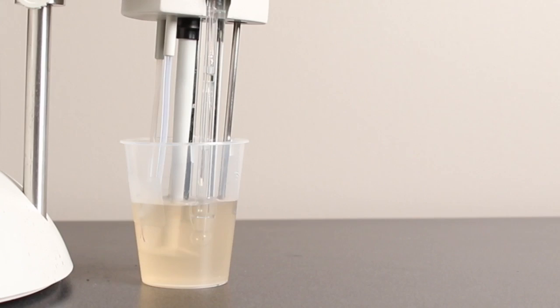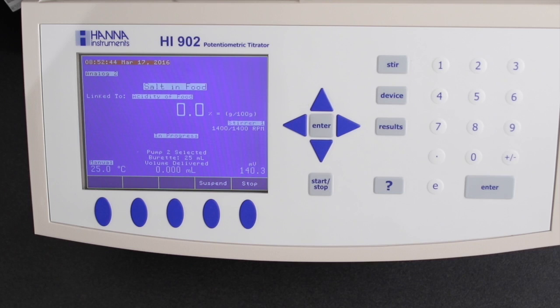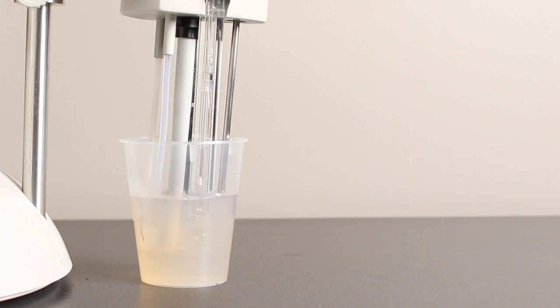Simply press accept to begin the titration. Salt is the first analysis, performed by Argentometric titration using 0.1 normal silver nitrate as the titrant.